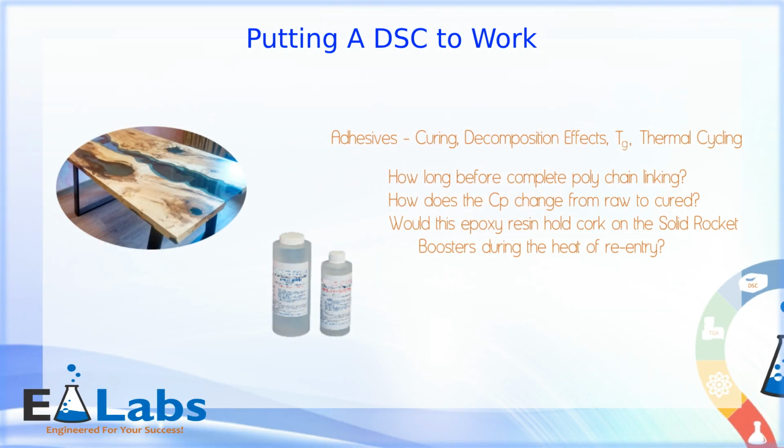If you designed a new glue meant to adhere a plastic mirror to a car's glass windshield, would you want to know how the thermal cycling of day and night might alter the glass transition temperature of this material between the time the cure initializes and the time the cure completes? Or maybe how many thermal cycles before the material decomposes from thermal stresses on the long chain bonds?